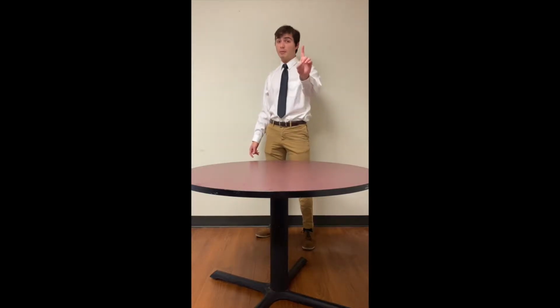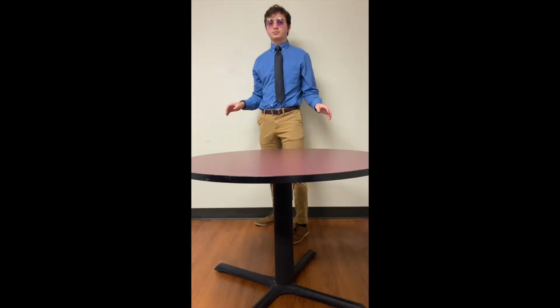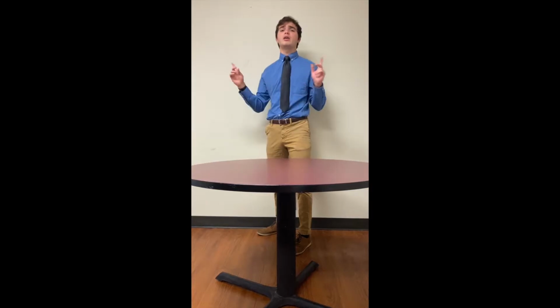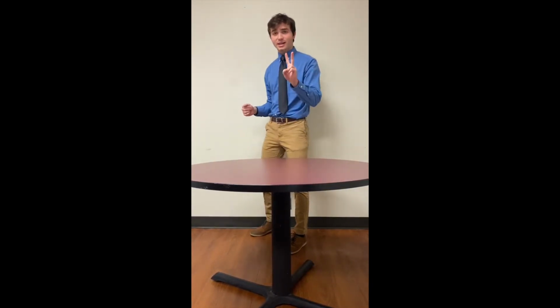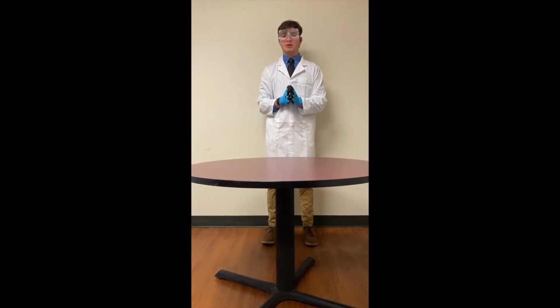But before we start, remember, safety is groovy. First thing you're going to want to remember is you need to be in a well-ventilated area. Luckily, this area is well-ventilated. Second thing you're going to need is a lab coat. All right, now we're ready to begin the experiment.